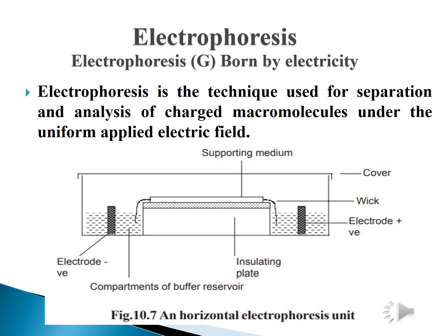For example, in agarose gel electrophoresis, it will be attached with the help of a wick, or it may even be immersed into the buffer, called submarine gel electrophoresis. Similarly, in acrylamide or polyacrylamide gel electrophoresis, the separating medium is a gel. It will be in contact with the two buffers directly.